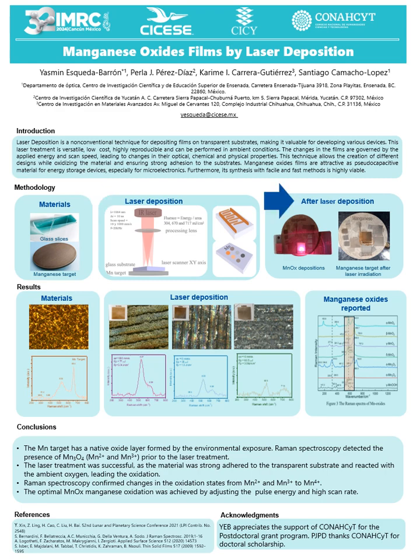Deposits were made using different scan speeds and pulse energies, resulting in changes to the optical properties, with coloration being the first indicator of material transformation. For these types of deposits, the laser operates above the ablation threshold, which allows for ionizing the medium, generating a plasma plume, and transferring the ablated material onto the transparent substrate. After removing the substrate, particles with the same characteristics as the deposit material are likely to concentrate.